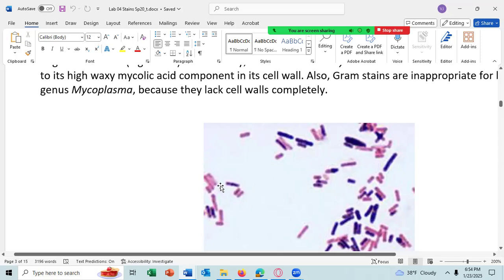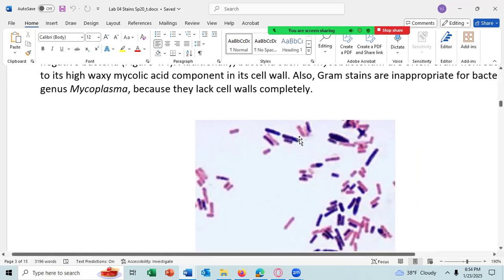What's happening is this rod has been broken right there, and that rod is broken right there, and then this rod, most of it looks like a ghost, meaning most of the cell is kind of gone, and so it looks ghostly. And then you have a little bit of the cell there, and even that one's a little bit ghostly. Whereas these cells, there's a very clear distinction between the inside and the outside of the cell wall.